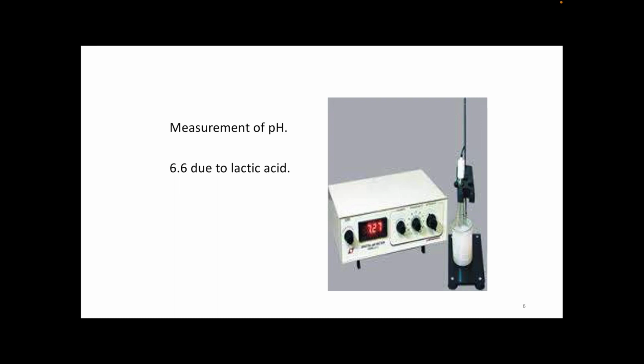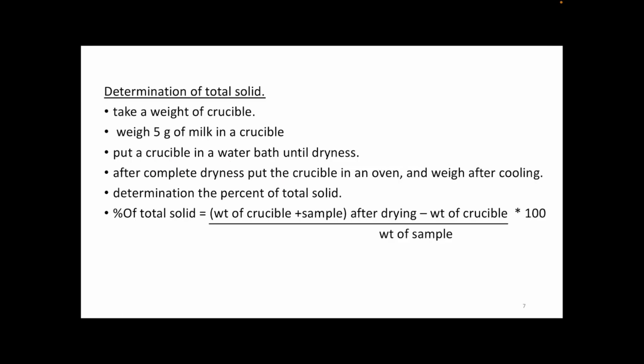Measuring the pH can be done by a pH meter, a regular pH meter, not one specific for milk. And the standard pH of milk is around 6.6. That's on the acidic side. This is weakly acidic because of the presence of lactic acid. Lactic acid gives milk its weak acidity.